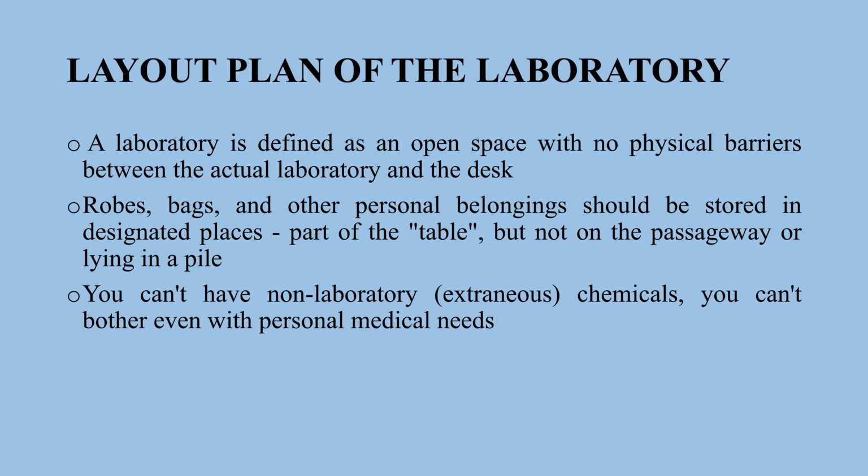Usually in a laboratory, it's very good, and nowadays it's a demand, to have open space without physical barriers. It's very important to have an open passageway in case of some emergency and some alarm.